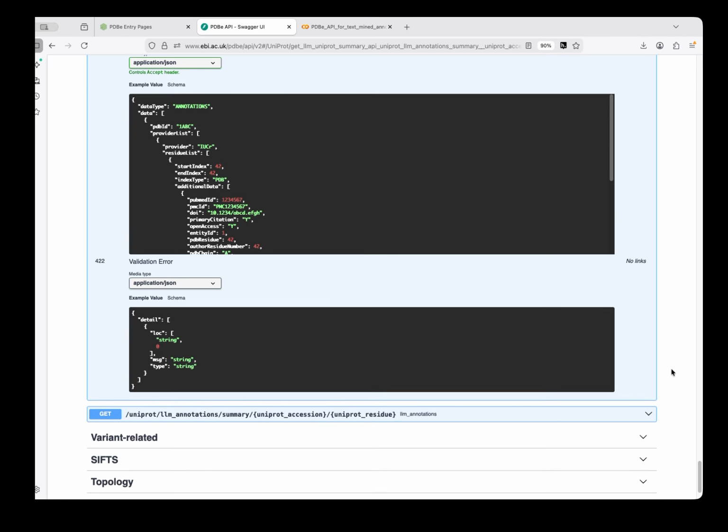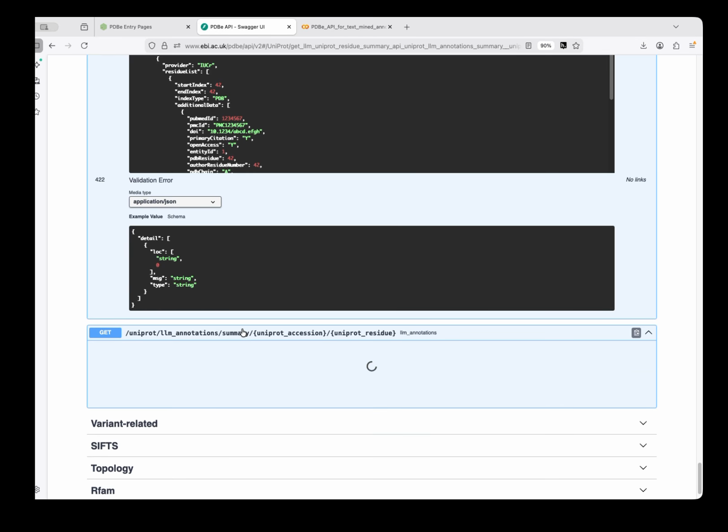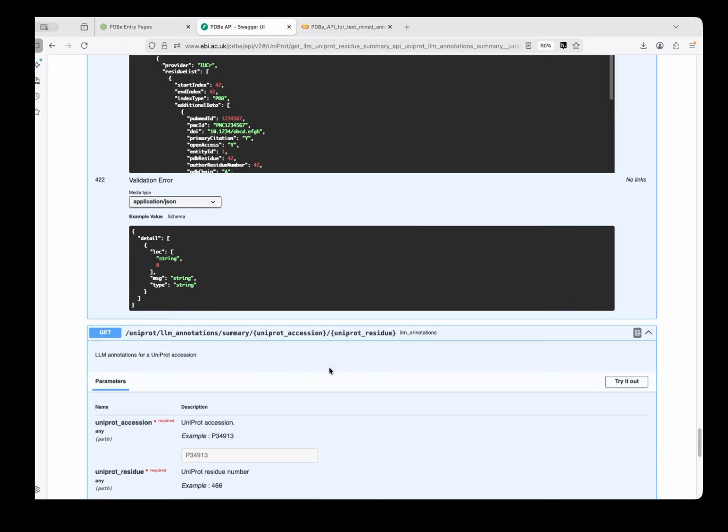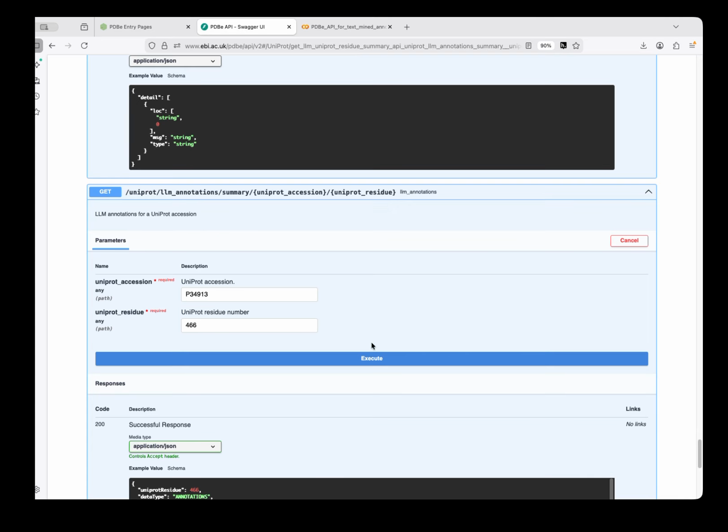If we go to our second option, we can also specify a residue, and in this case it's not the one from the PDB file. Here we have to give the UniProt residue. If we go back again, we use our Q8BH51, and then we specify here, shall we try the tryptophan again, which was 495.